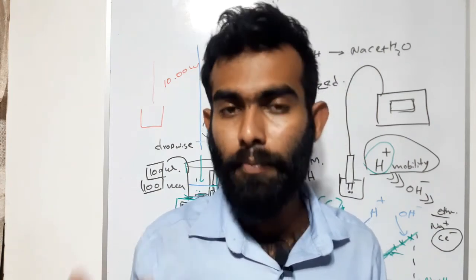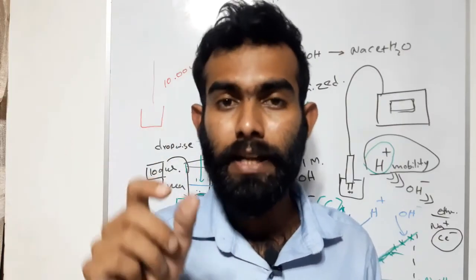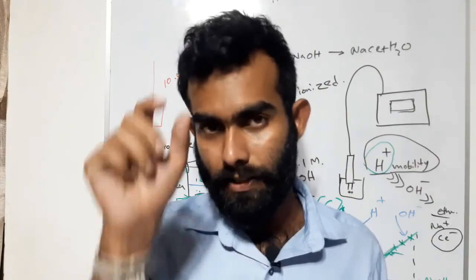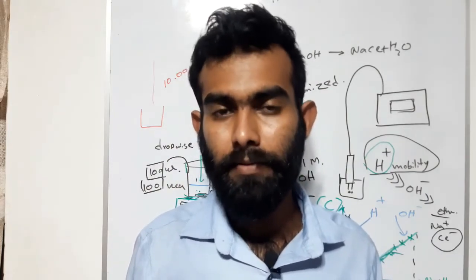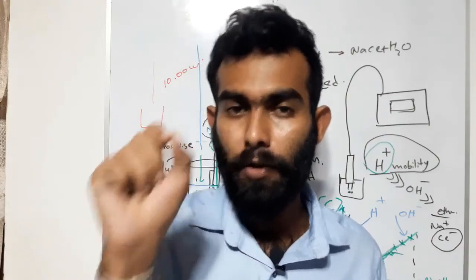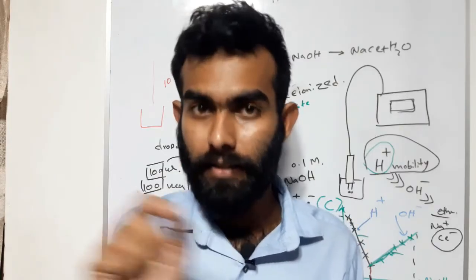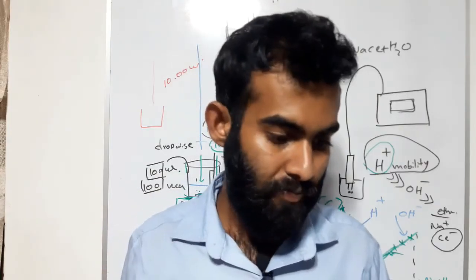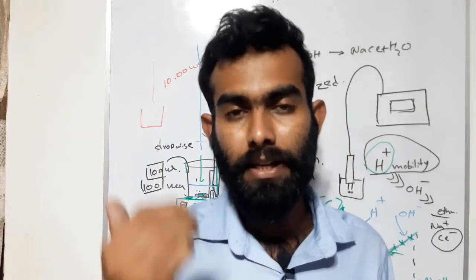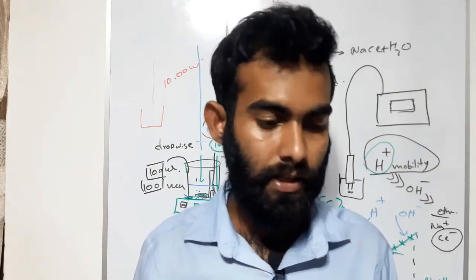And we have to take care when we are using the magnetic stirrer, it can damage the conductivity meter cell. So we have to be careful about that magnetic stirrer. When we switch it on, we have to make sure the edge of the conductivity meter cell is not close to the magnetic stirrer, magnetic tablet. Okay. We are using a 50 ml burette to add sodium hydroxide to the titration.